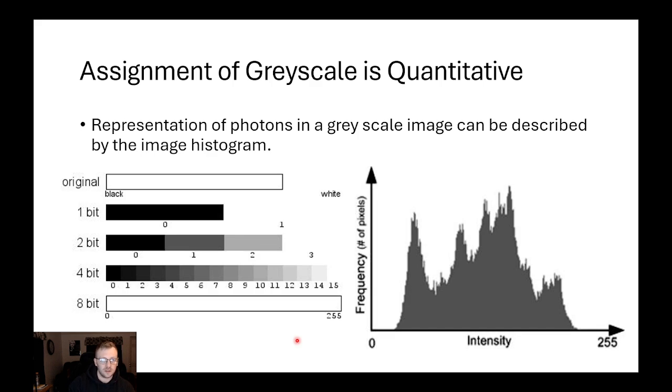This is kind of a hard concept to get across to people, so I'm trying to explain it in multiple ways. Our intensity is equal to the current generated and assigned to a bit depth value. The current generated is determined by the intensity or number of photons that are detected by the photodiode in the camera chip. That is what makes these digital images quantitative, so that we can actually do analysis on a digital image, because the histogram was generated mathematically based on real data that was detected by the camera. I hope that makes sense.